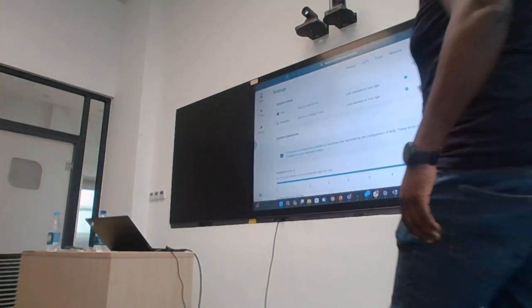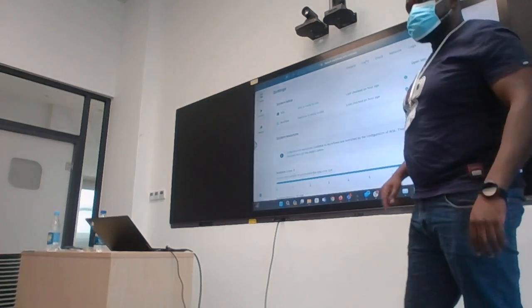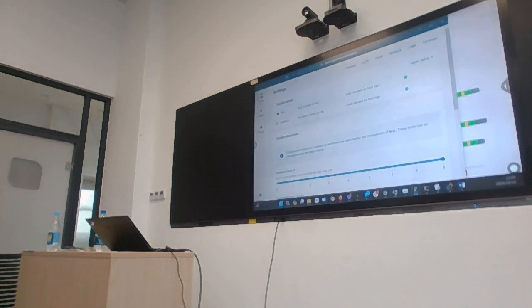Can we just start on this side? But we'll have to go first per person. But can I look at Epi2Me? Look at Epi2Me. Yeah, that's the bomb. Let's start.